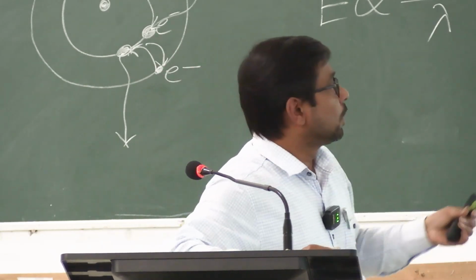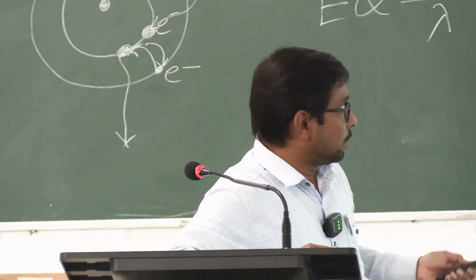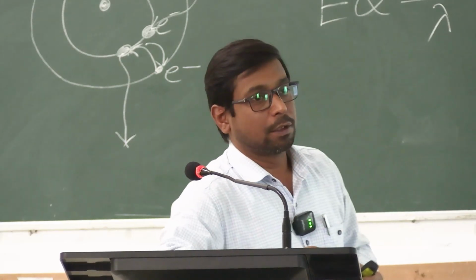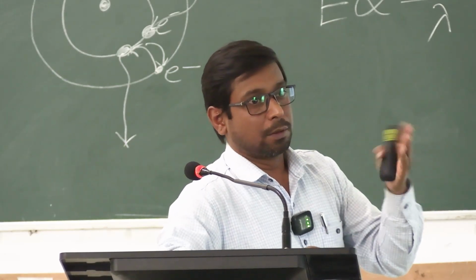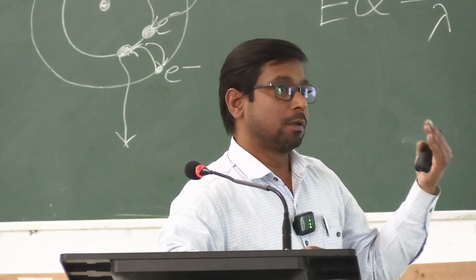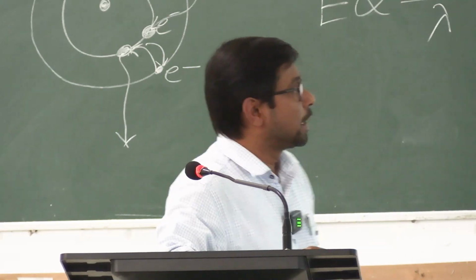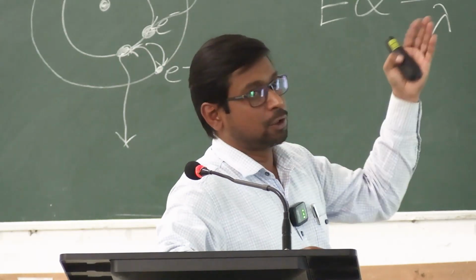And here also in the transmission electron microscope, we have a fluorescent screen. On that screen the image will be captured, and that will go to the detector. Through the detector, and a computer system and software, we can find a better image. And the same thing for scanning electron microscopy. Here we are on these two only.